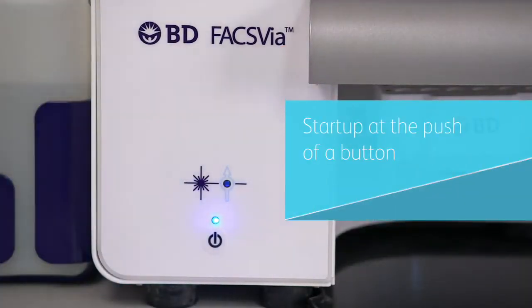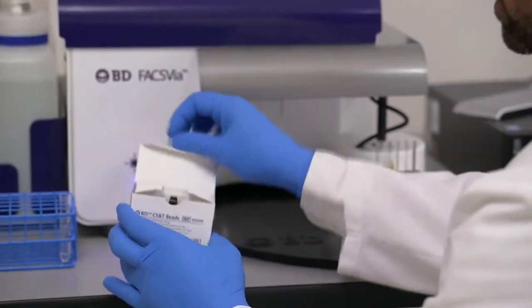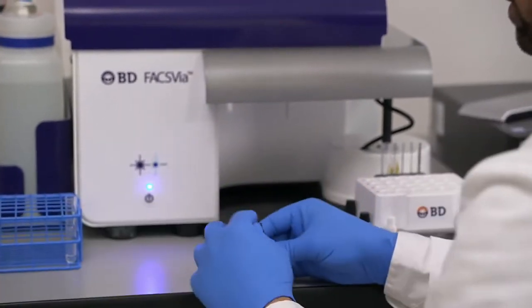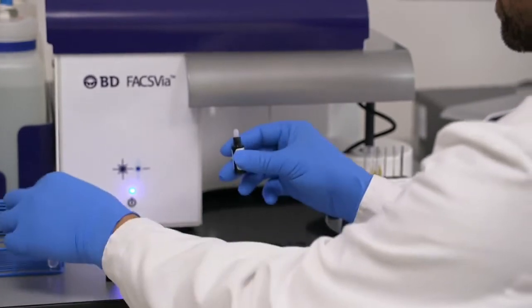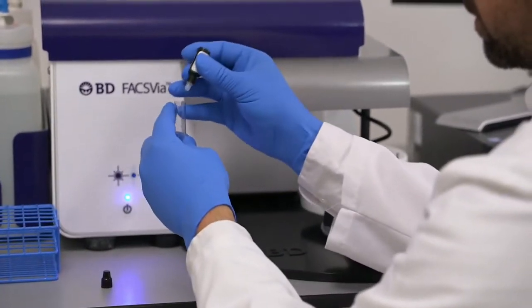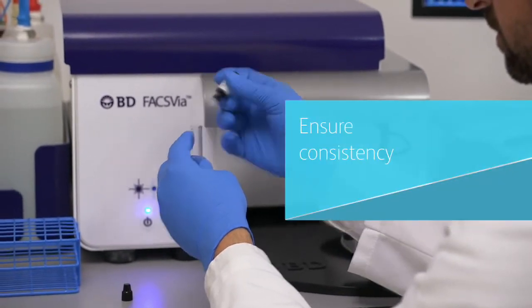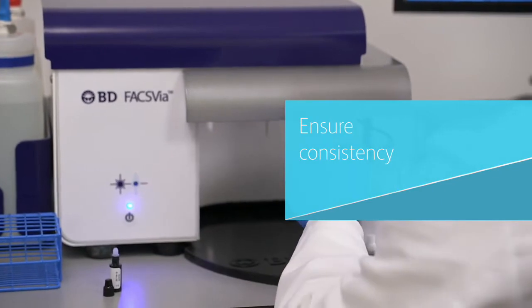Just push one button and the instrument startup is completed automatically in less than 15 minutes. The BDFAX VIA uses automation to simplify instrument setup and QC. QC consists of a simple one-tube setup using CS and T beads, providing accurate instrument performance in less than five minutes. This ensures that consistent results can be obtained even with inexperienced operators.